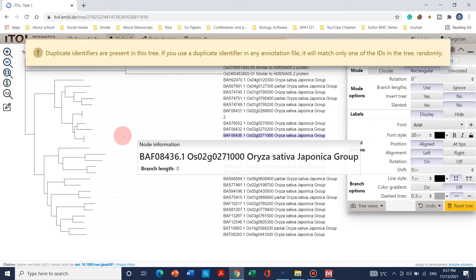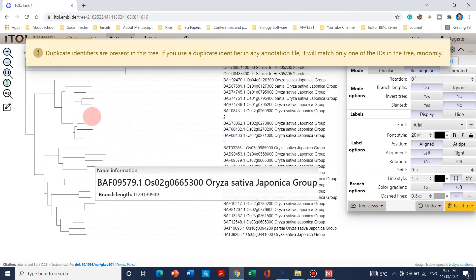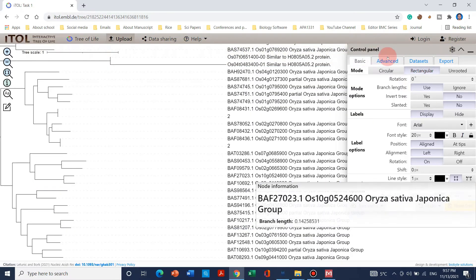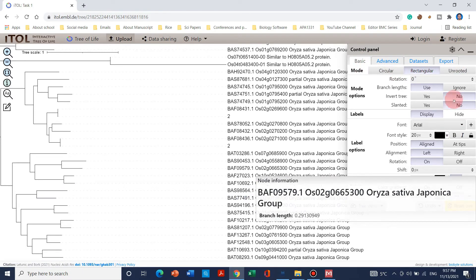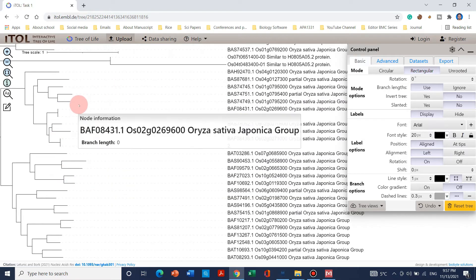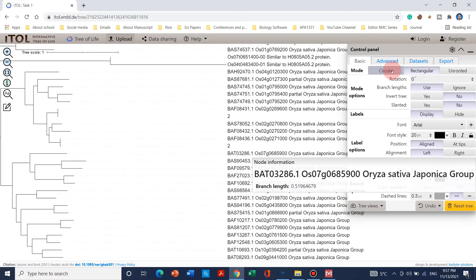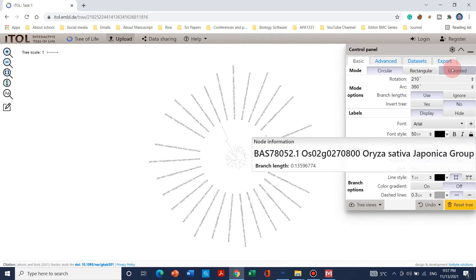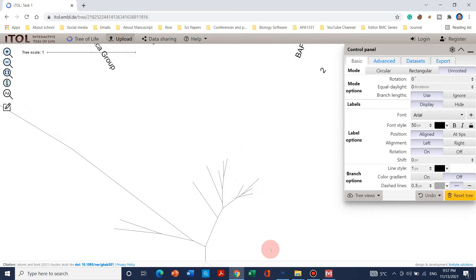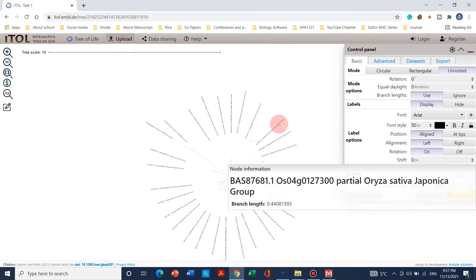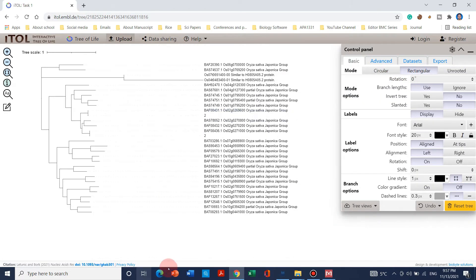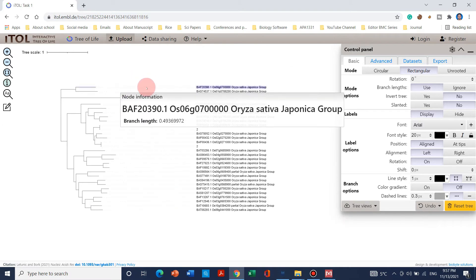After uploading, a window will be prepared where you can manipulate and create beautiful figures. The basic window has this file format. You can use rectangular tree format, or if you want circular just click here and you can see the circular layout. If you want unrooted, click the unrooted option — it's up to you. Let's begin with the rectangular format.